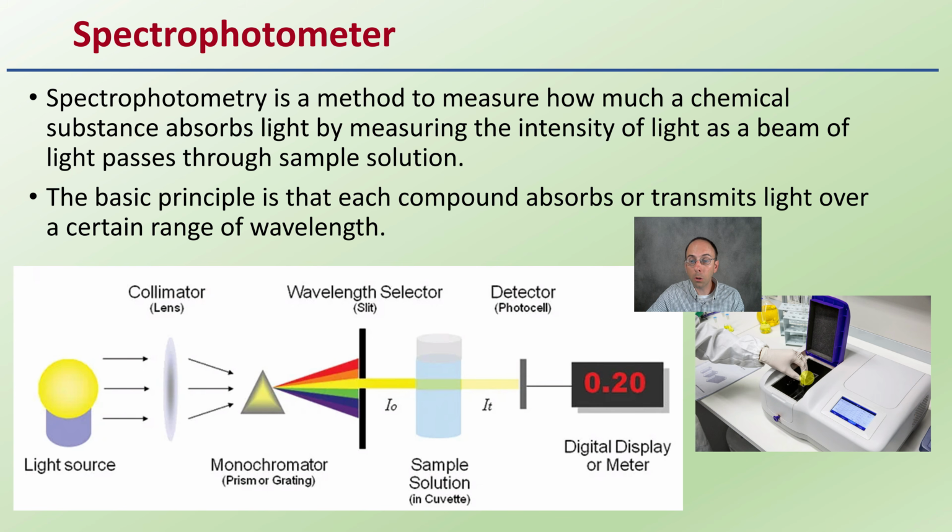Again, the reason you have to close this is to eliminate outside wavelengths of light. But this shows how a simple piece of equipment can be utilized to look at the light and separate it out into wavelengths, to more sophisticated electronics, utilizing wavelengths of light to look at how a sample might absorb or transmit certain wavelengths to determine its concentration.